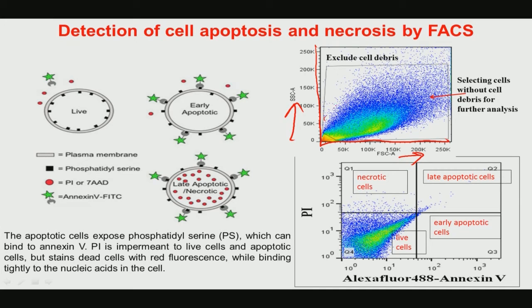There will be a lot of concentrated areas where these dots will be present in multitude, and there are some areas where these dots are very discontinuous, or where they are not very dense. First of all, each dot in any FACS plot contains the information from one single cell. So, essentially, if you now do proper gating like the way it is shown here, you exclude the cell debris, and then you get this data.